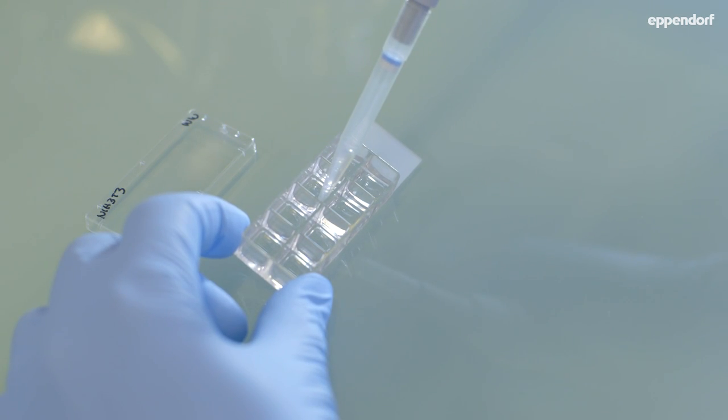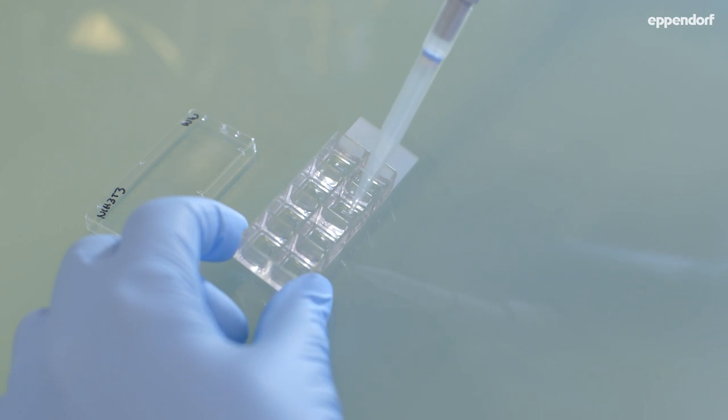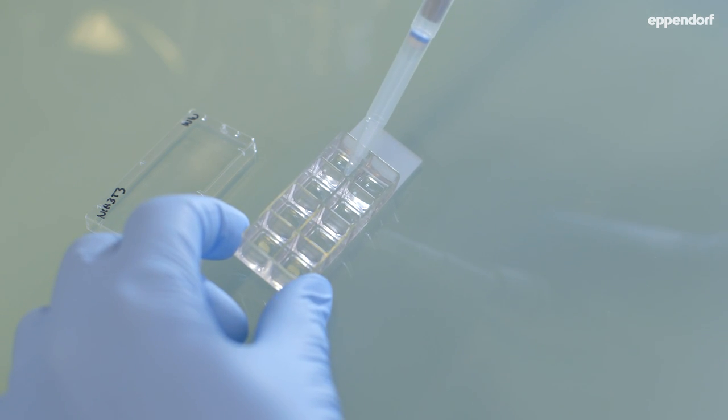Eppendorf's cell imaging slides are available in different formats. Their tissue culture-treated surface supports attachment of adherent cells. Most cells can be grown directly on the glass.